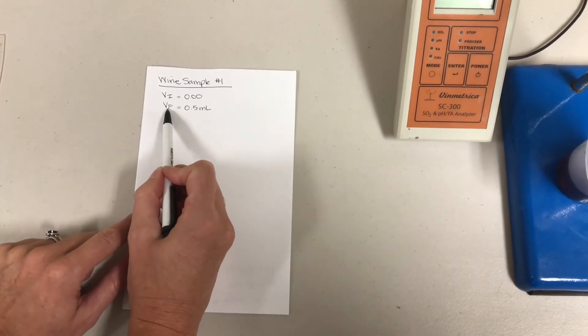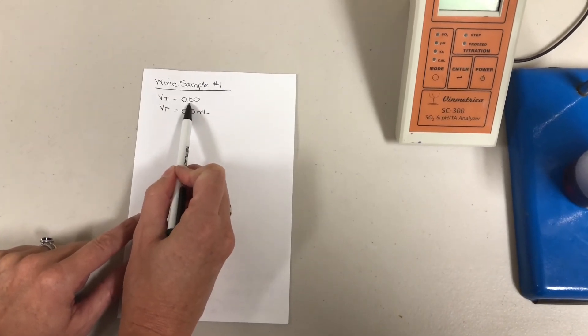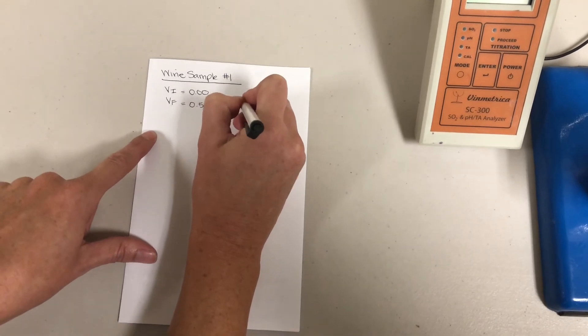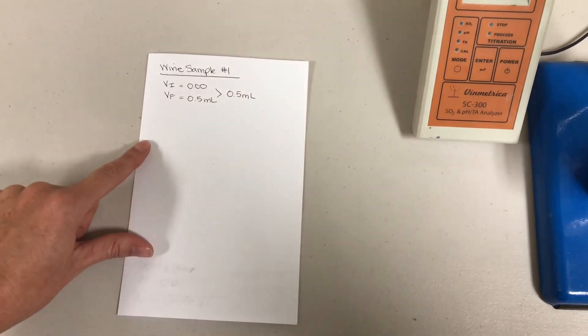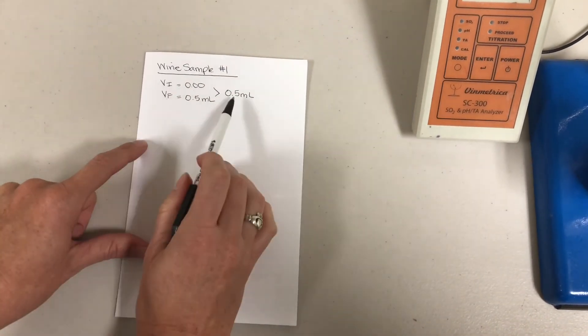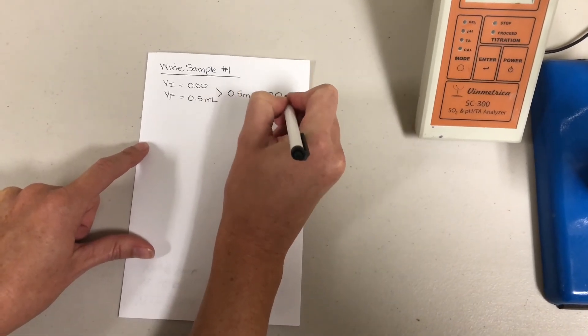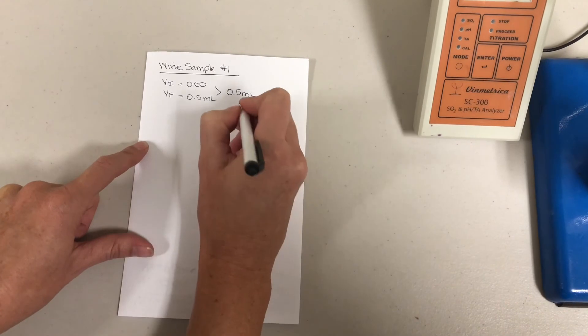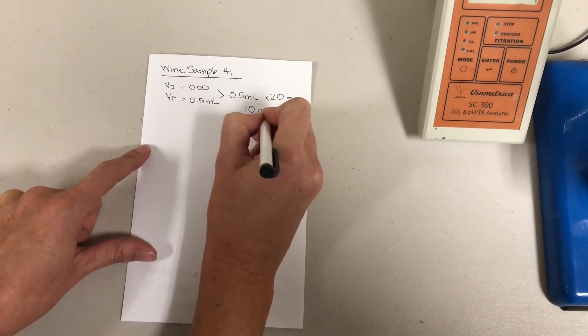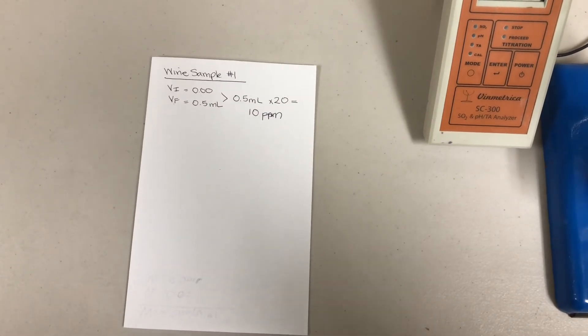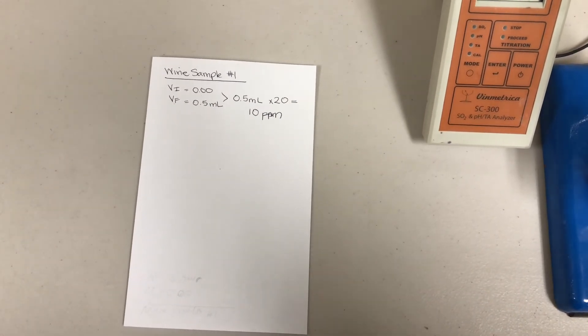You take your final volume, subtract it from your initial volume, which comes to 0.5 mils. Take that value, multiply it by 20. This wine sample has 10 parts per million of free SO2.